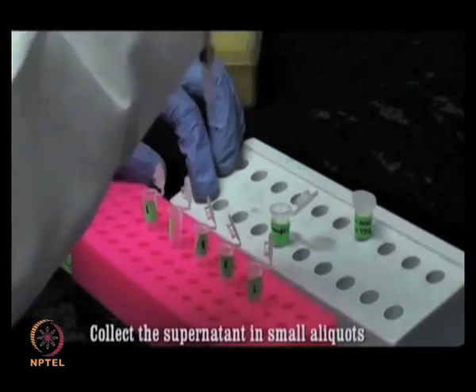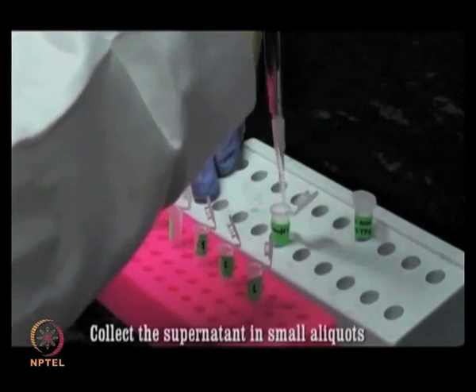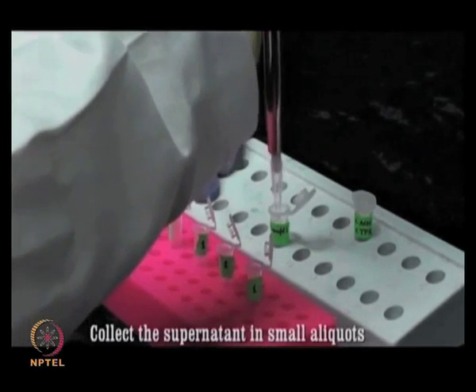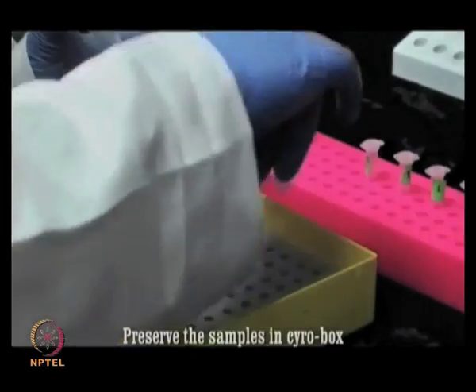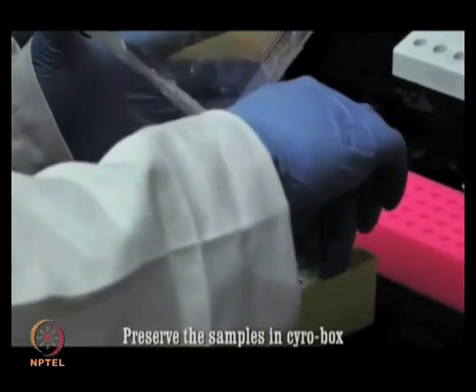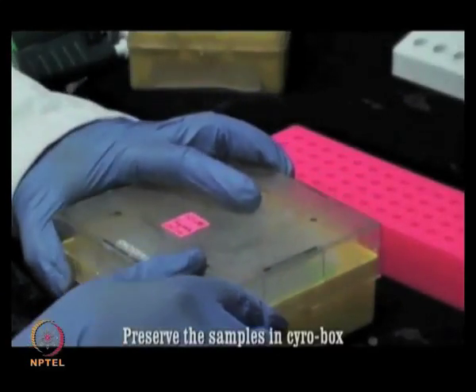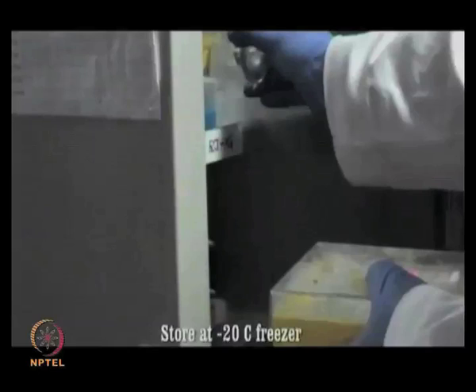The efficient extraction process is essential to ensure the release of peptides from the gel matrix to the solution. Now, all the solution volumes described in the protocols are recommended volumes, but depending upon the experimental requirement, you can optimize and change these volumes and the incubation timing according to your experimental requirements. Now, these samples can be stored and used for further mass spectrometry analysis.